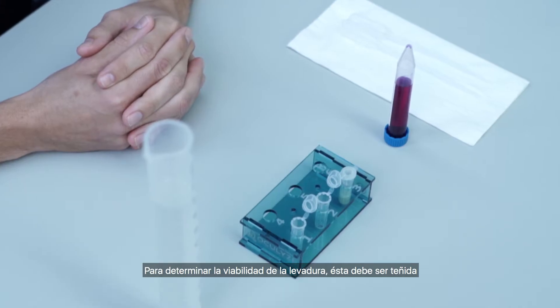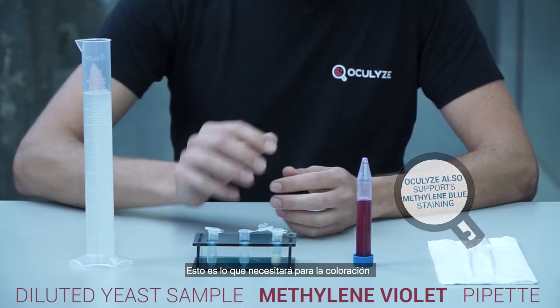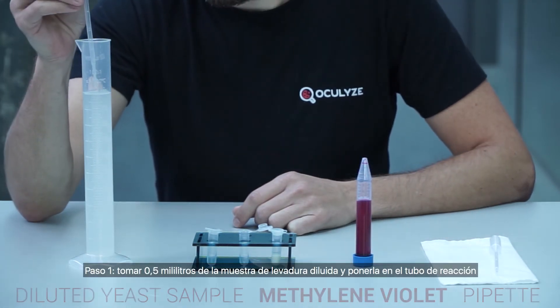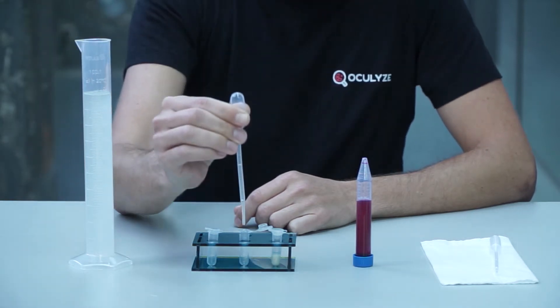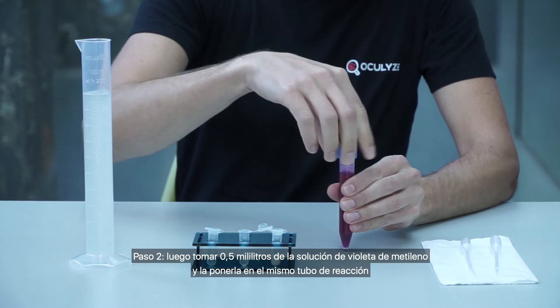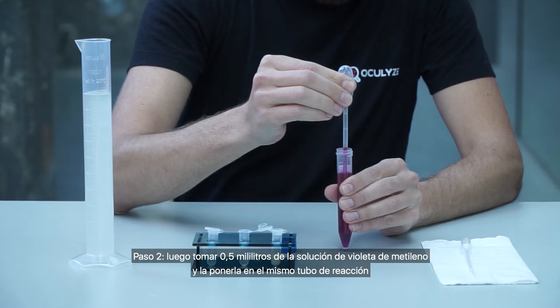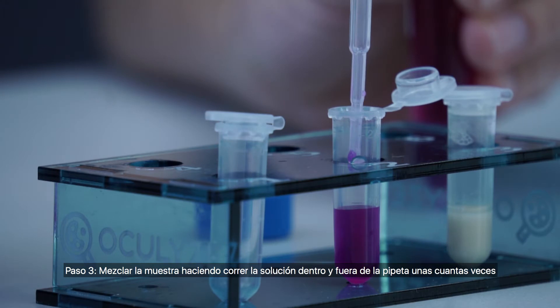In order to determine the viability of the yeast it must be stained. We recommend using methylene violet. Here is what you'll need for staining. Take 0.5 milliliters of the diluted yeast sample and put it into the reaction tube. Then take 0.5 milliliters of methylene violet solution and put it into the same reaction tube. Mix the samples by running the solution in and out of the pipette a few times.